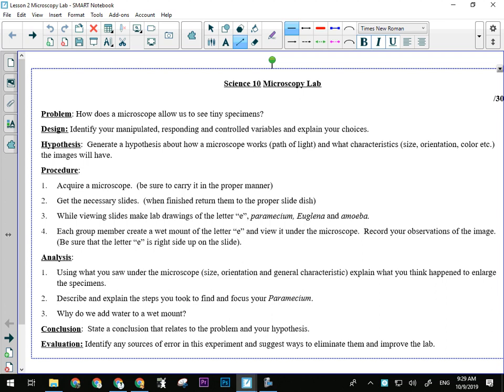We're using all the different settings on the microscope because we're looking at different specimens, and we're hoping that those different specimens are going to look a certain way when we look at them through the microscope. Incidentally, I'm talking about the design part here, but I'm being much more cryptic about it than normal, trying to wean you off of giving you the variables directly, even though I'm still kind of doing that.